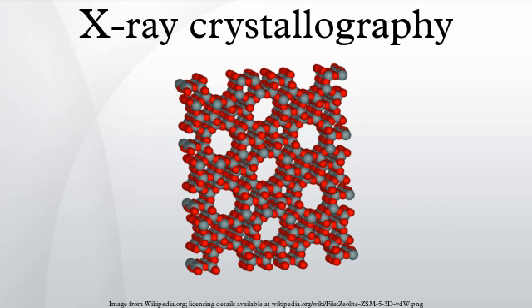Initial phasing. The data collected from a diffraction experiment is a reciprocal space representation of the crystal lattice. The position of each diffraction spot is governed by the size and shape of the unit cell, and the inherent symmetry within the crystal.